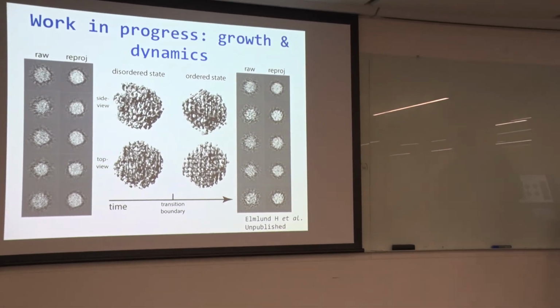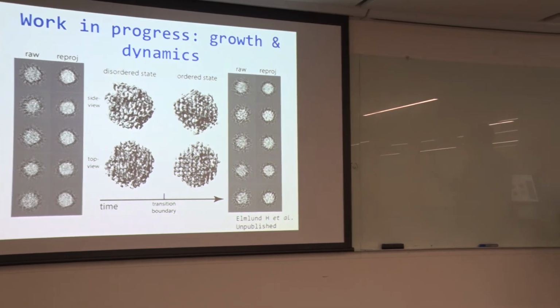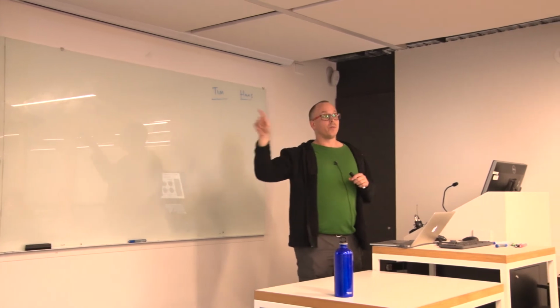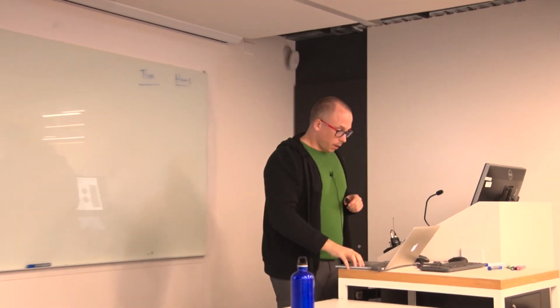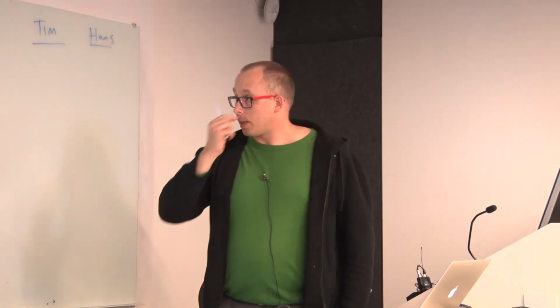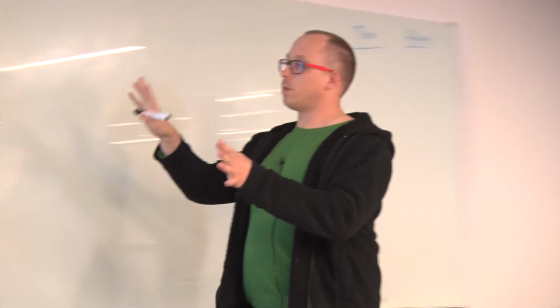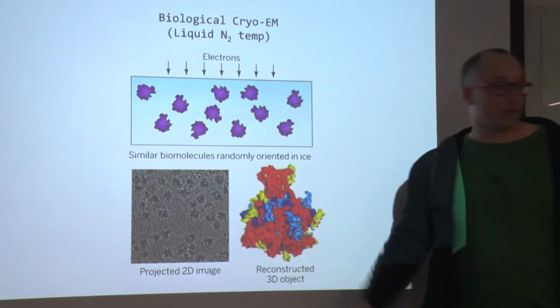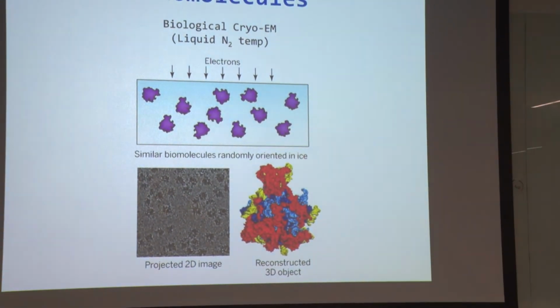But here you could envision more sophisticated sorting algorithms where you would trace out individual atomic movements throughout the series. And then back to the biomolecules, which initially caught my interest. The assumption that this 3D reconstruction methodology relies on is that these are nearly identical copies. This is unfortunately seldom the case.